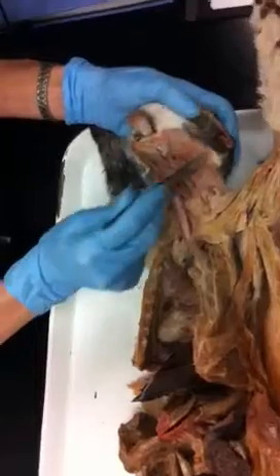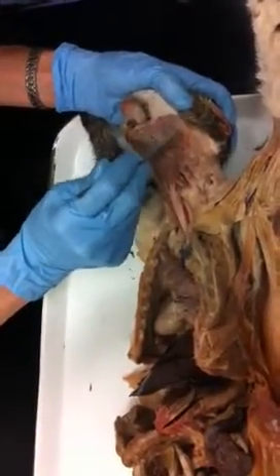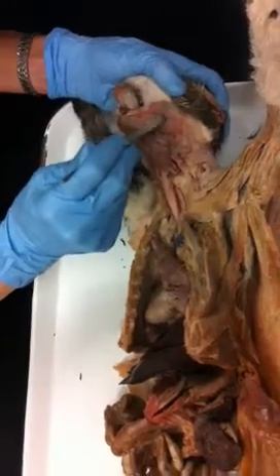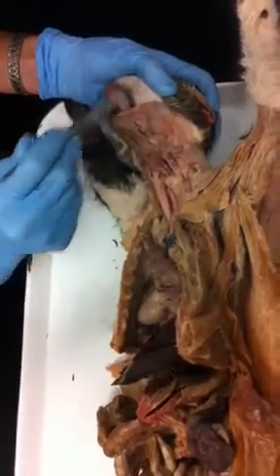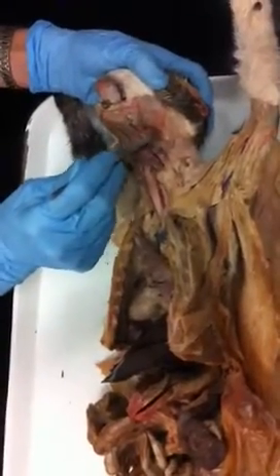Your whole mouth is open, so we'll be able to see your epiglottis on your cat. Okay, so let's start with the glands. 3 sets of salivary glands. Right under the ear is the parotid. And you see this duct coming across the face of the masseter muscle? That's the parotid duct, delivering saliva to the back of the mouth. This right here, right under the mandible, is the submandibular.